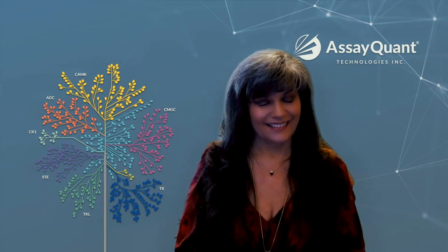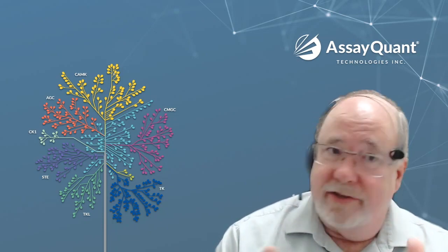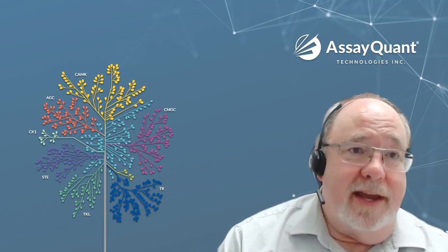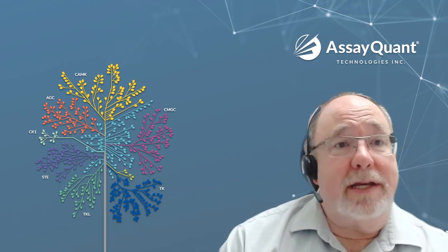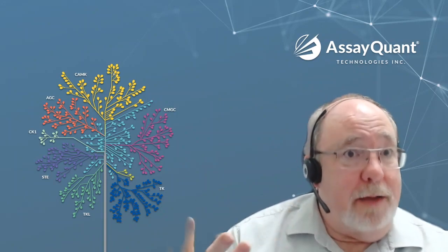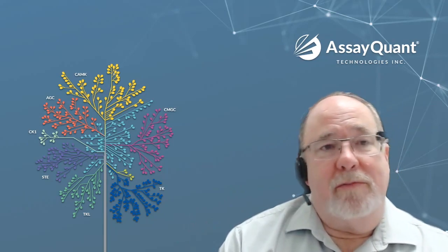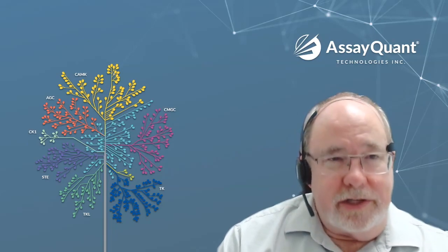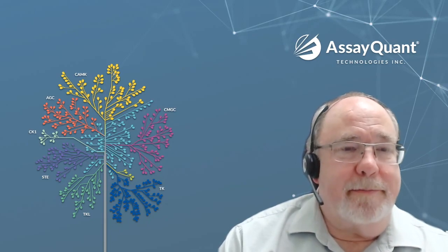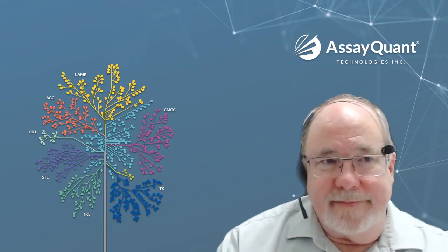We're also looking hard at phosphatidylinositol kinases. PI3K is a common one that people are asking about. We're hoping we can find something there. It's a little bit tough, as you might imagine, because when you start with a phosphorylated substrate, you're going to get a high background. So we're crossing our fingers, and that's part of one of our R&D exercises to see if we can get a PhosphoSens assay for the PIs.